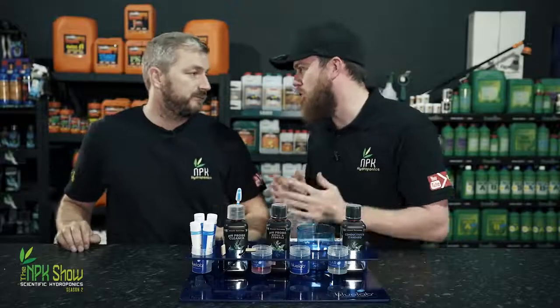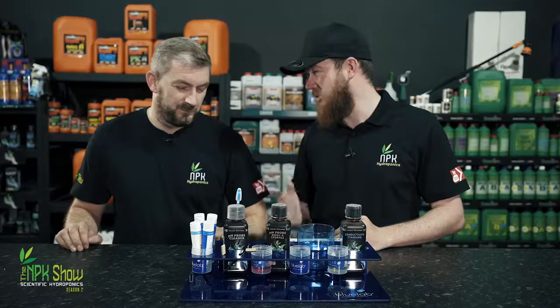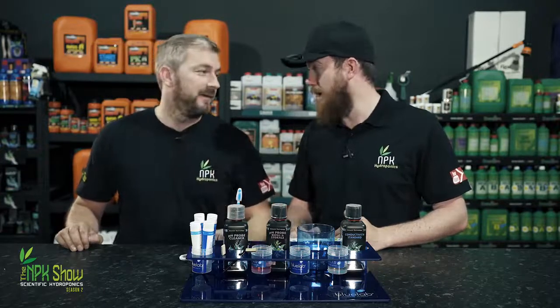So just a short one today, Barry, but it's very important. pH and EC meters and how to get the best from them, how to clean them, how to look after them, and some top tips. You'd have to use the best. That's the top tip. Yes, Bluelab is the best.